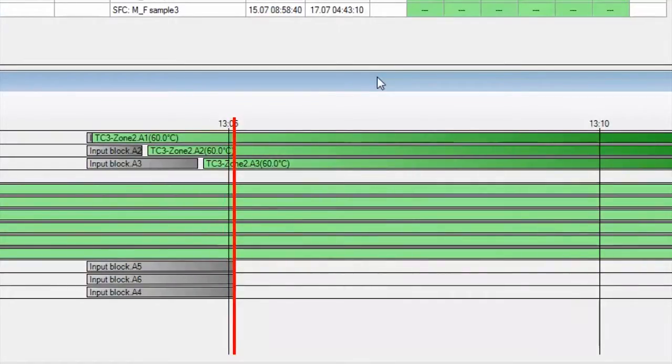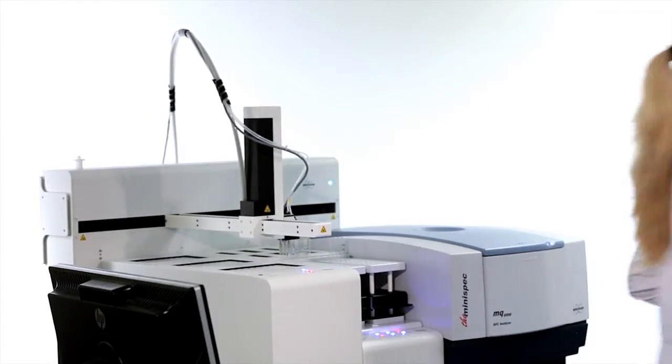Upcoming steps and the progress of the method can be monitored by the operator. The time when the measurement is done is calculated. Now all steps are handled automatically.